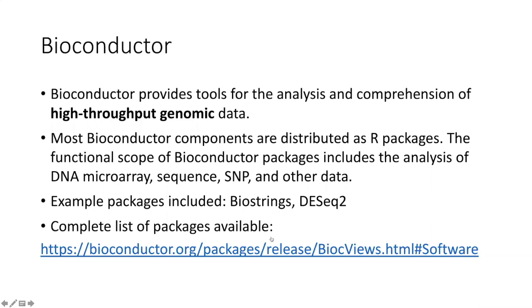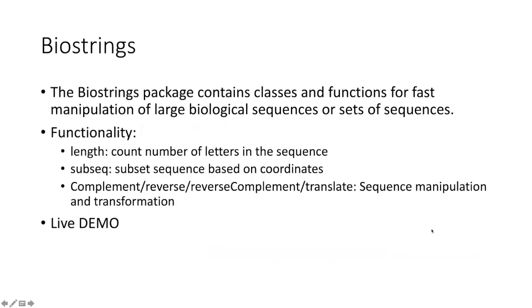Okay, I will not cover everything about Bioconductor packages. I will just choose one package as an example to showcase how to unleash the power of a specific package for a specific task for genome analyses. This Biostrings package contains classes and functions for fast manipulation of large biological sequences or sets of sequences. There is a lot of functionality available. I'll just give you some examples.